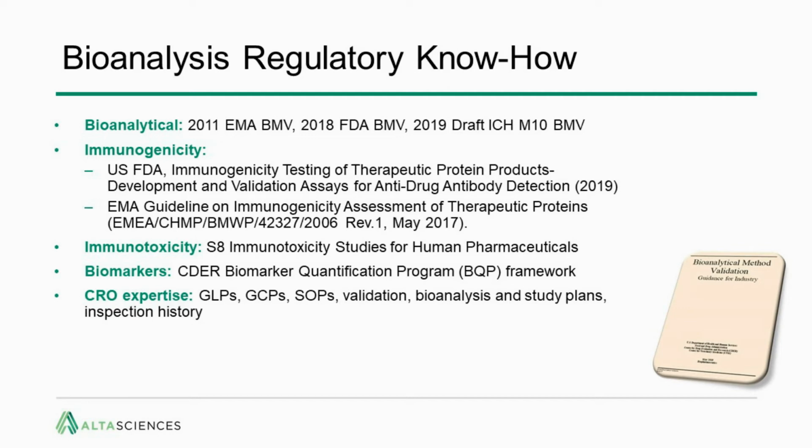And this all also relies on the CRO expertise in good laboratory practice and application of those guidance, as well as good clinical practice, standard operating procedures, validation, bioanalysis and study plans, and the regulatory inspection history that the CRO has.